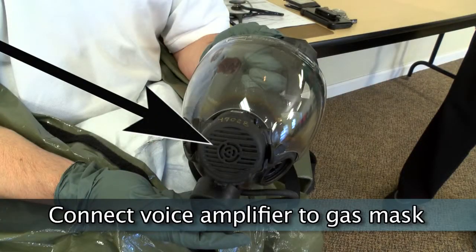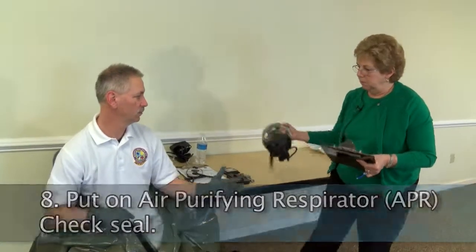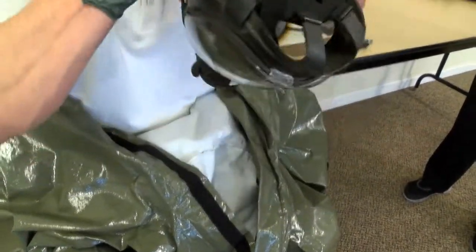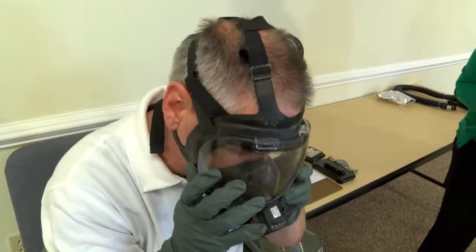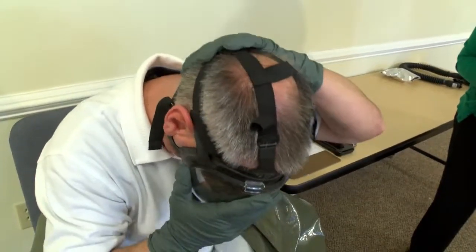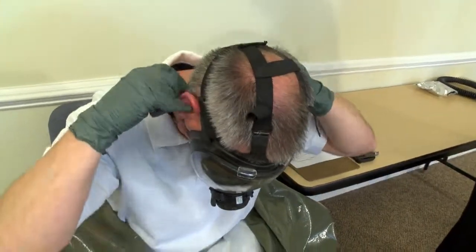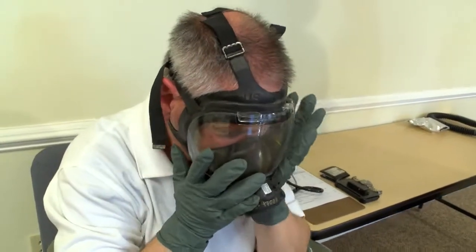Connect the voice amplifier to the gas mask and check the seal. Don the Millennium gas mask and check the seal. The Millennium gas mask ranges in sizes small, medium and large. The provider must have been fit tested for the mask. When inspecting, be sure there is a good seal. Masks should collapse when the worker takes a deep breath, and the straps should be tightened in the sequence: bottom, middle, top.